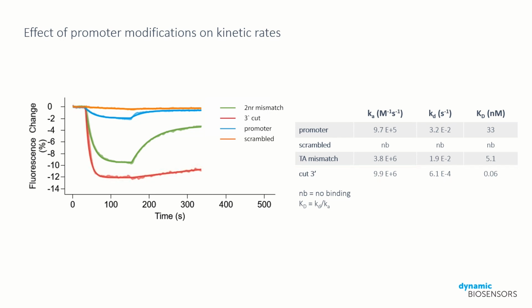We should be aware that the dissociation was slowed down so much that the signal change observed during the screening experiment might have been insufficient to calculate an accurate curve fit. We can therefore use the preliminary binding data generated in this screen to help establish the conditions for a higher precision study conducted with multiple analyte concentrations.